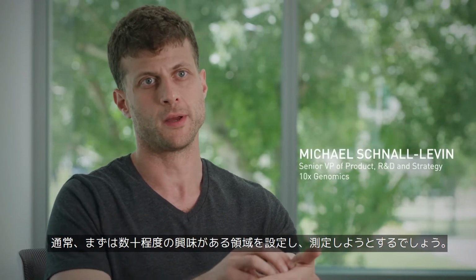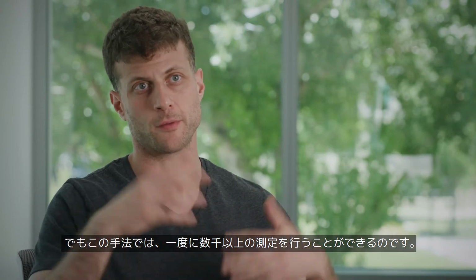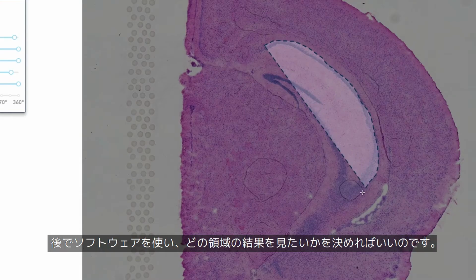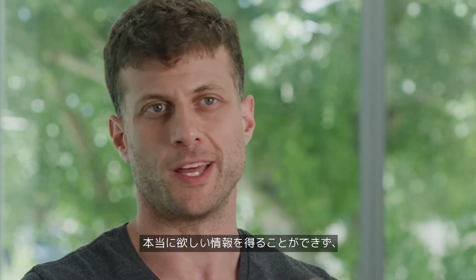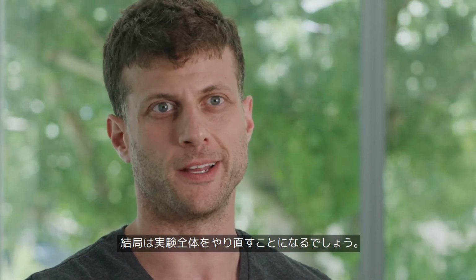And then try and define some regions, like say tens of regions that you care about that you want to measure. But in this solution, you basically make thousands or more measurements at once. It's like you're capturing all the information, you're banking that, and then later in software you can decide this is how I have to look at it, versus you capture a small number of points with some other technology, you realize you don't get what you want, and then you'd have to basically do the whole experiment over again.